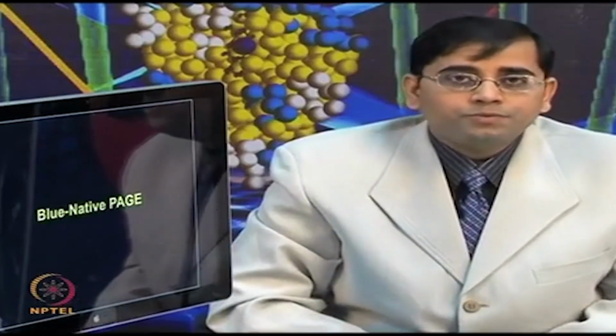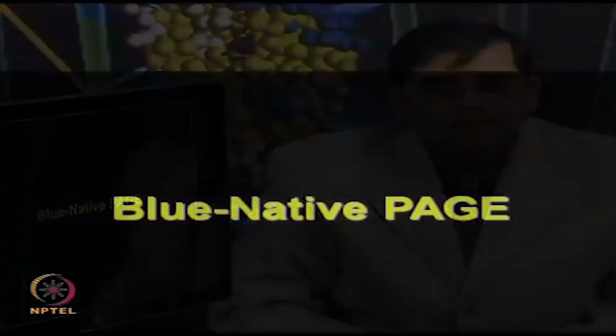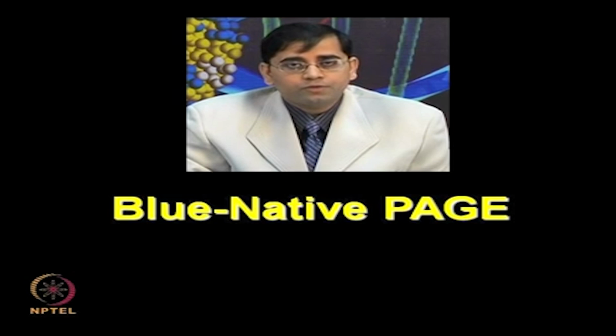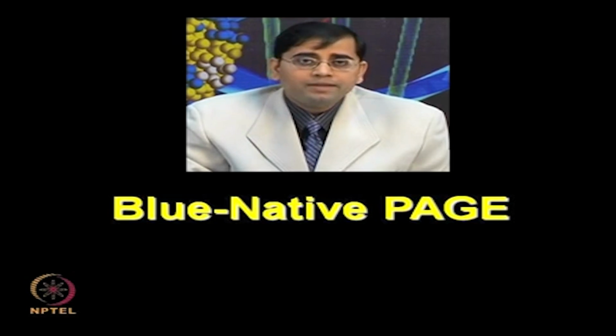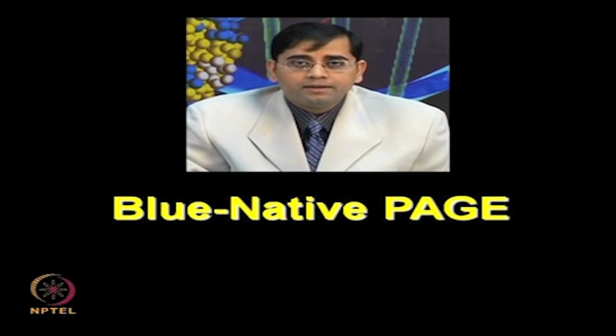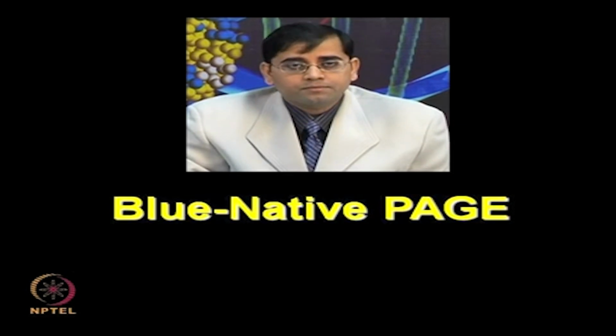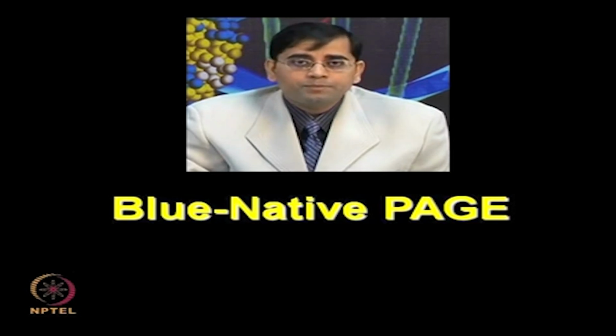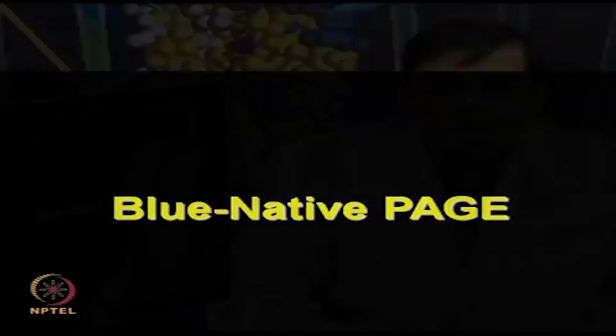So, let us now move to a variation of SDS page known as blue native page, blue native polyacrylamide gel electrophoresis. Now, in SDS page we are providing a denaturing environment, we want to denature the protein, whereas in the blue native page we want to separate the proteins in their native condition.